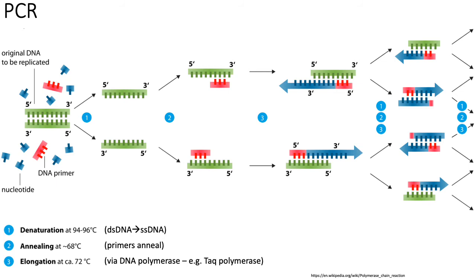But here, just for illustration, PCR is an amplification procedure where you can start with a relatively small set of double-stranded DNA molecules, and then, through the addition of, for example, random primers, well, first you have to denature your double-stranded DNA molecules, randomly anneal different primers, elongate, and repeat this procedure.